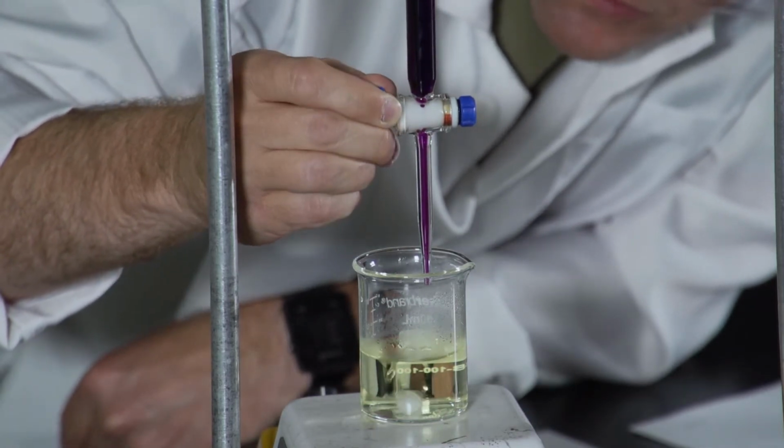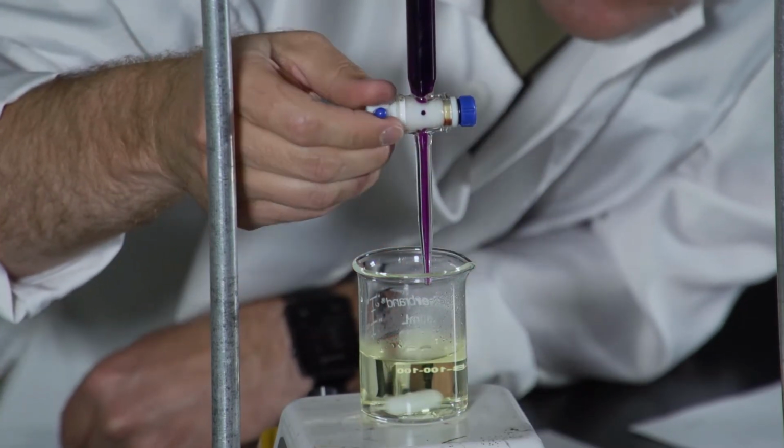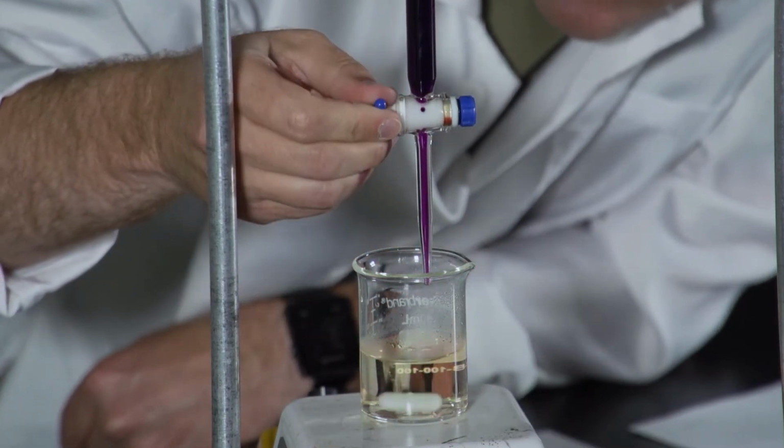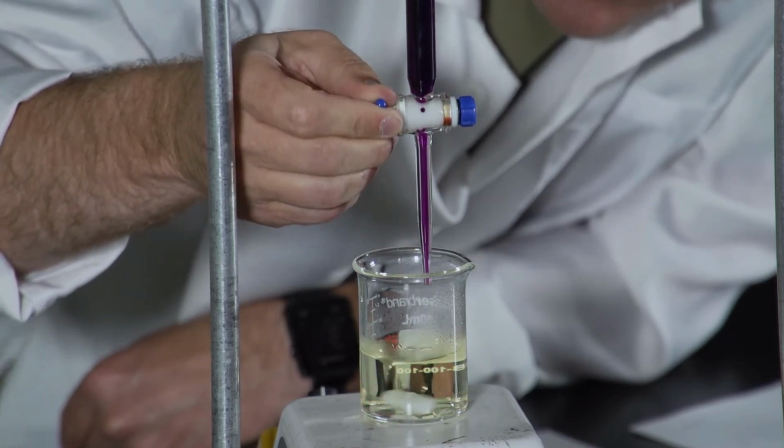Again, that endpoint is the solution will go from the color that it is now, greenish yellow, to clear, and then just a hint of pink, and then that's the endpoint.